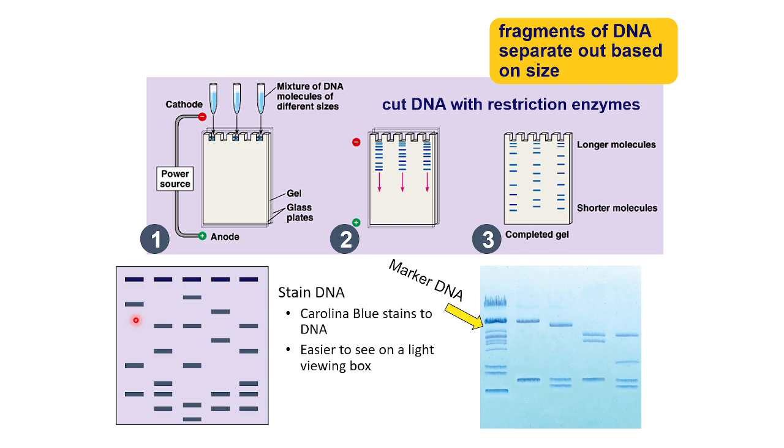So there are 3 forms in which your plasmid exists. In a normal plasmid you observe 3 bands, but when you're doing restriction digestion you see more than 3 bands, or multiple bands, depending on how many restriction enzymes you have used, or you can say the number of types of cuts you have introduced inside your plasmid.